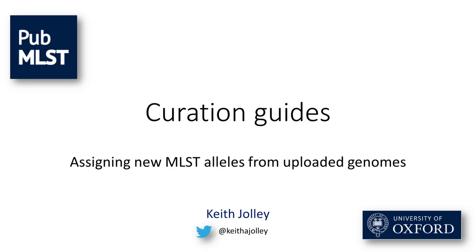In this video I'm going to show you how a curator can assign new MLST alleles for genomes that have been uploaded to a PubMLST database.